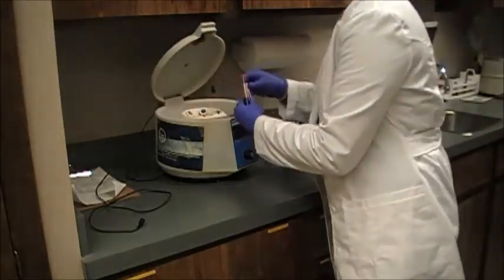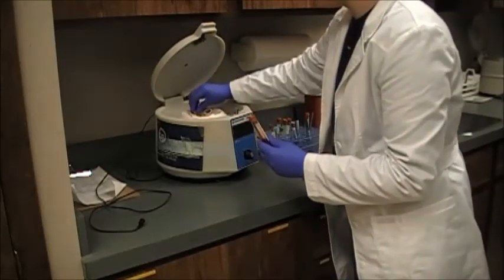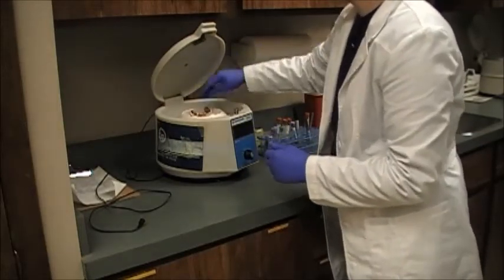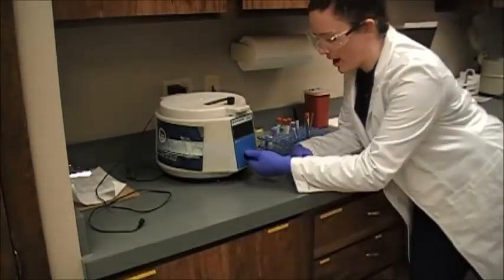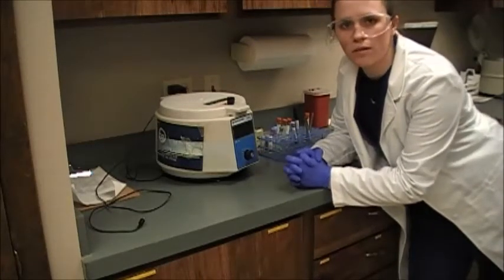Now I can pop these in the centrifuge. I'm putting the balancing tube across from each of them — a purple across from the purple, and a balanced red across from the red. This centrifuge has a set speed, so I'm going to go ahead and start it. I'll let it spin for about 8 minutes, then come back and harvest the serum and plasma when it's done.